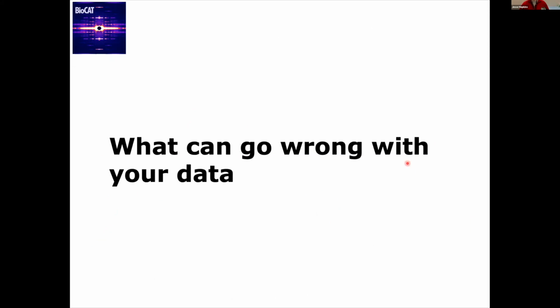All right, what I'll do next is go on to talking about what can go wrong with your data and how you see that in the profile, but I'll take a brief moment to see if anybody has any questions.